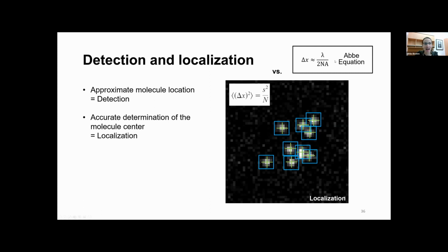And if we remember, hopefully I wasn't rushing too fast over the very first slide, how the Abbe equation looked for the diffraction limit, then we can see one thing quite clearly. Before, we had a very strongly defined limit which we couldn't overcome, because we weren't changing anything with the microscope, so the numerical aperture stayed the same. Furthermore, we also used very specific wavelengths, and we wanted to stay in the area of visible light.